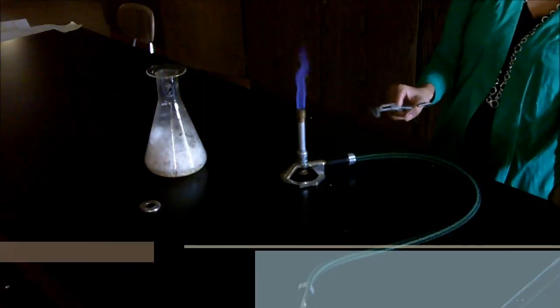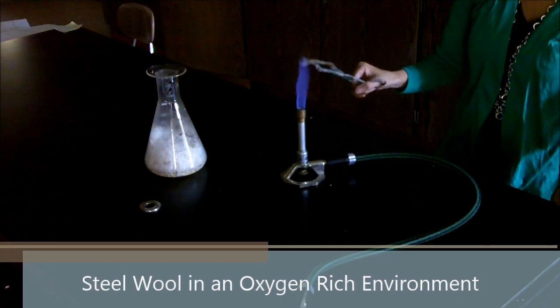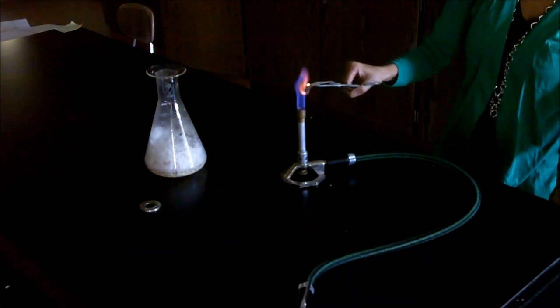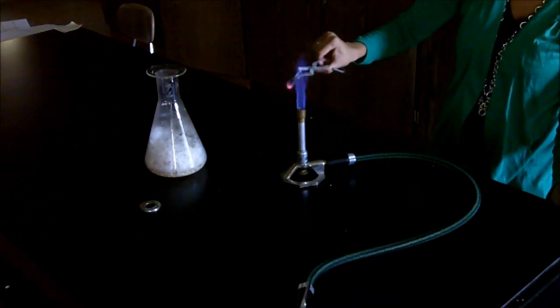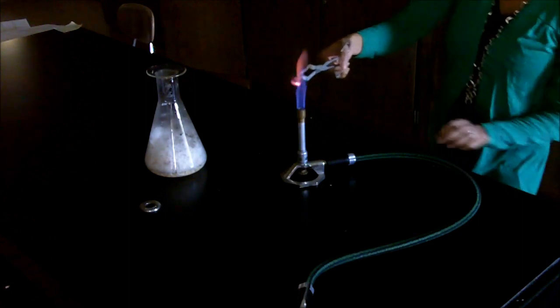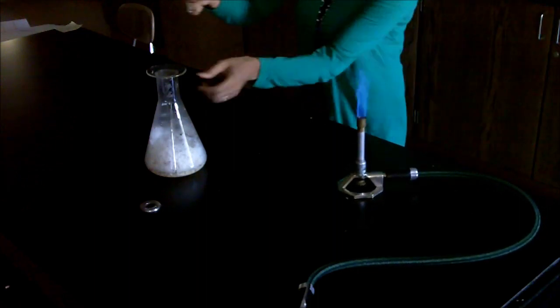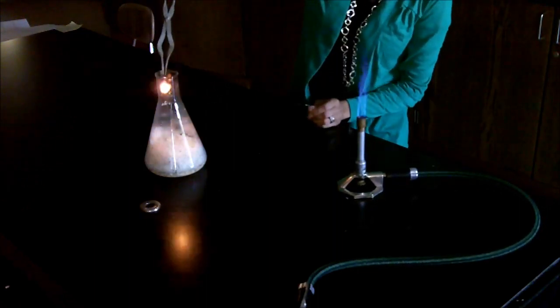We have a piece of steel wool that I'm using a pair of tongs to hold on to. I'm going to go ahead and show how it glows inside of the flame. We do have some glow in there, but what I also want to show is how it glows inside an oxygen-rich environment.